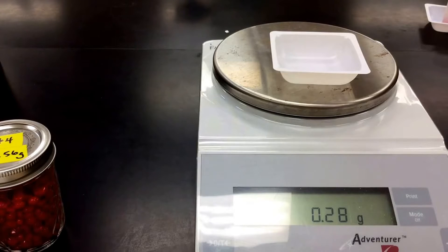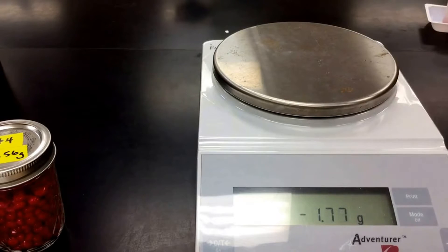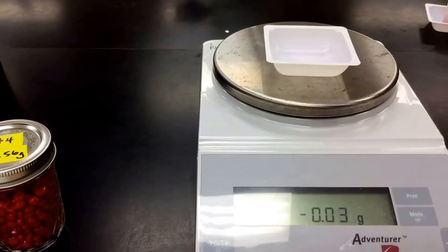So this particular red hot weighs 0.28 grams, 0.28 to 0.29. If I use another red hot, I'm going to tare our balance. The first red hot I chose weighed 0.28 grams, the next one I chose was 0.41 grams. So clearly not all red hots weigh the same. So your best method would be to not just take the mass of one red hot because there's going to be some individual differences there, but maybe multiple red hots.